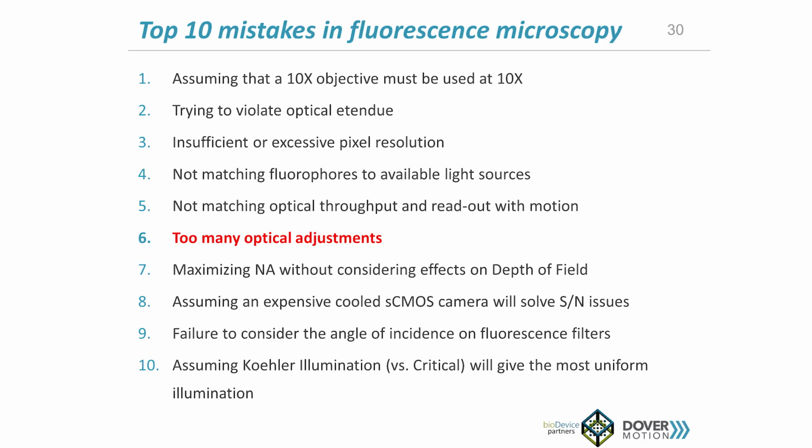Another issue that I frequently encounter are too many optical adjustments in the system. But I'd like to say you want to have no more than necessary and no less than necessary. Kevin has an adage on that. I say in many cases, the capacity for adjustment all too often leads to the likelihood of misadjustment. Or alternatively, in the real world, we call that using hard stops and tighter tolerances and not spending time twiddling knobs while adjusting a system.